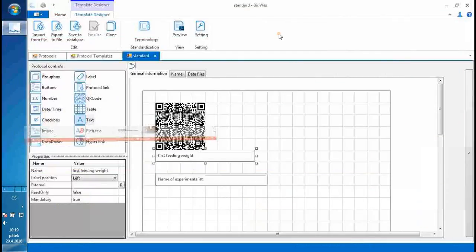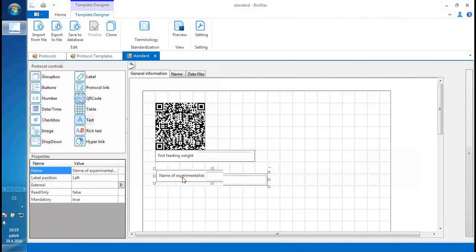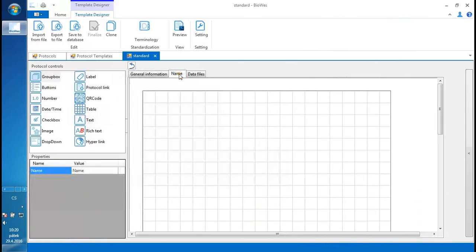Okay, this was related to the terminology, and right now I'll try to show you how we can establish the communication with the measurement devices. So on the sample I showed you from our laboratory where we were with the microscopes and with the cells, the microscope can provide the information about the setting of the microscope.